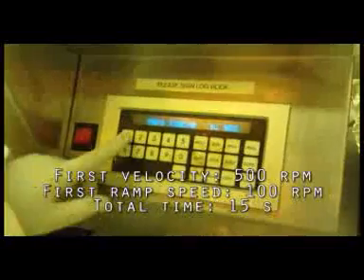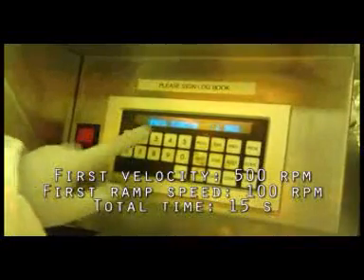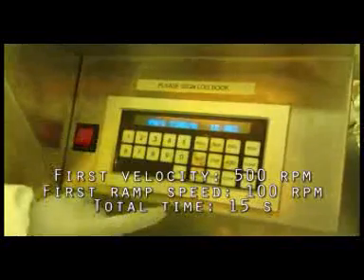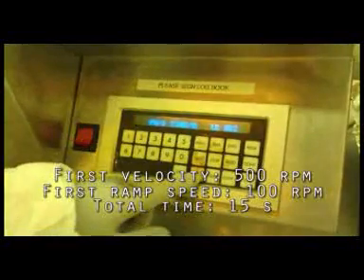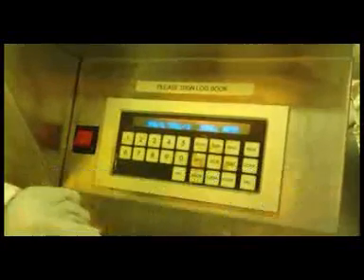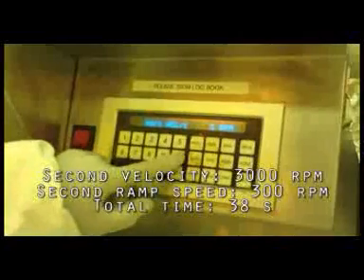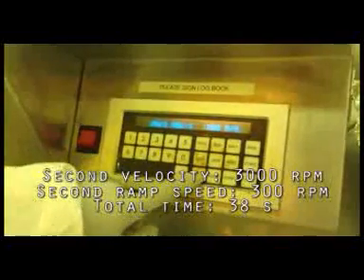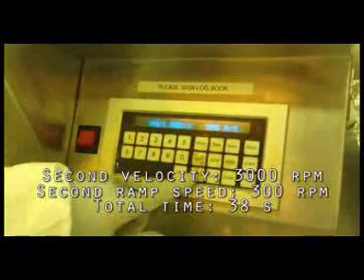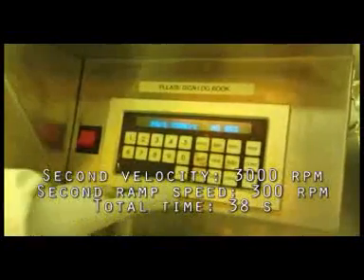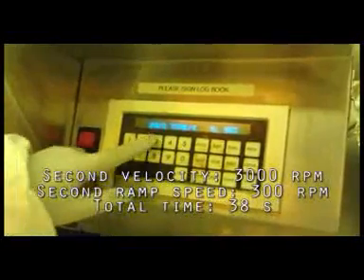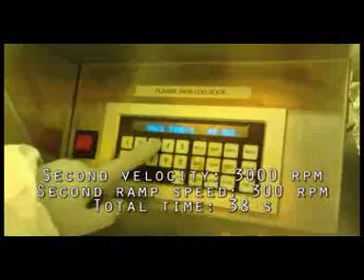First speed, 500. Ramp speed, 100. Total time, 15 seconds. Second spin speed, 3000. Ramp speed, 300. Total time, 38 seconds.